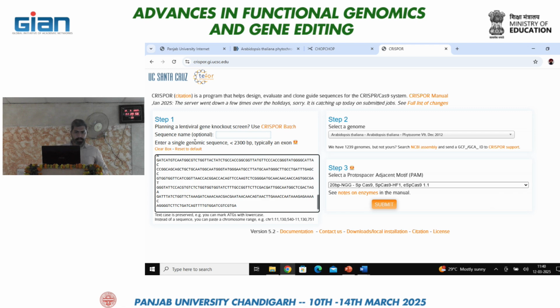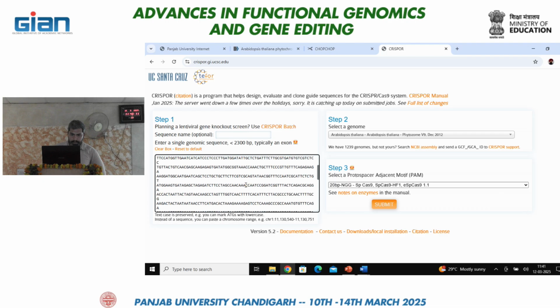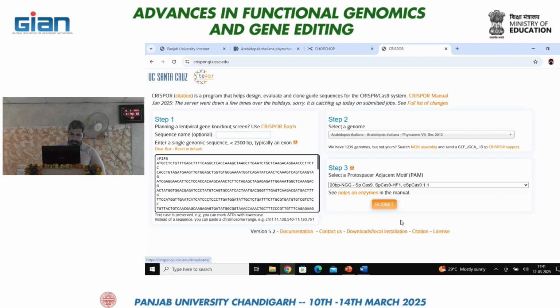In this step 1 box, it is clearly mentioned that you shouldn't upload anything greater than 2300 base pairs. So different tools have their different limitations, advantages and disadvantages. And once you have filled all these boxes, you can just submit it.